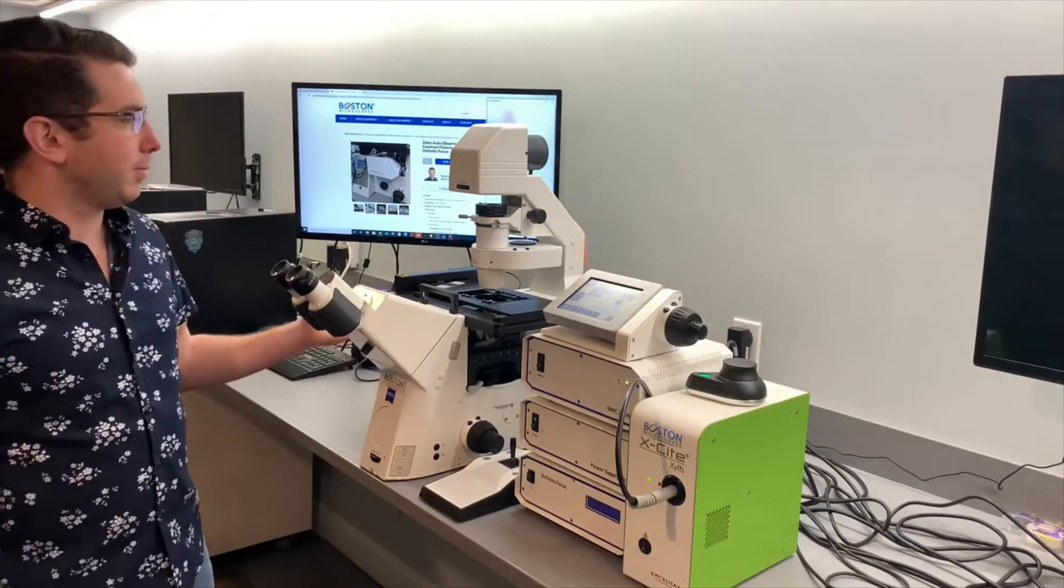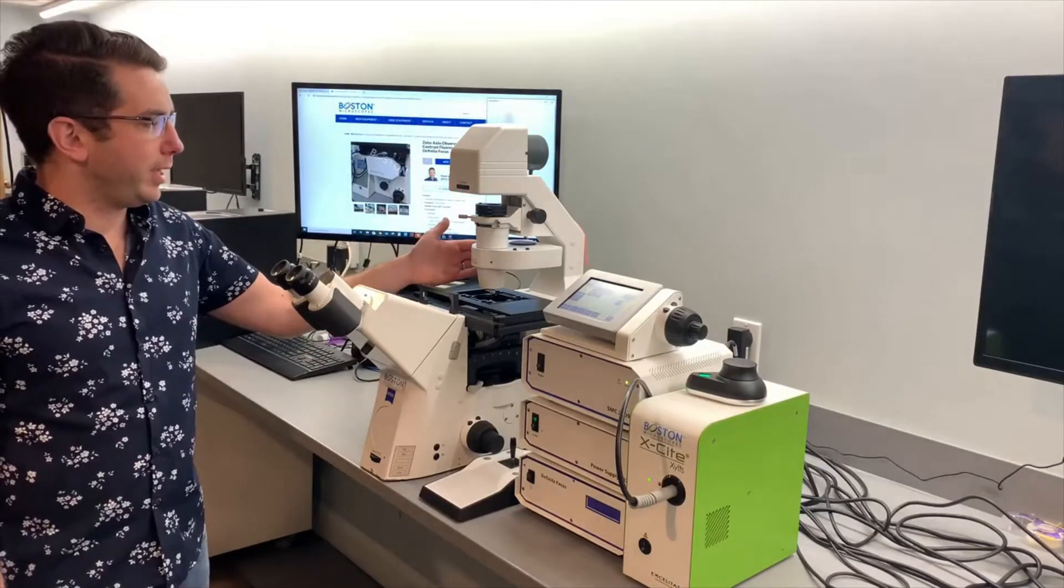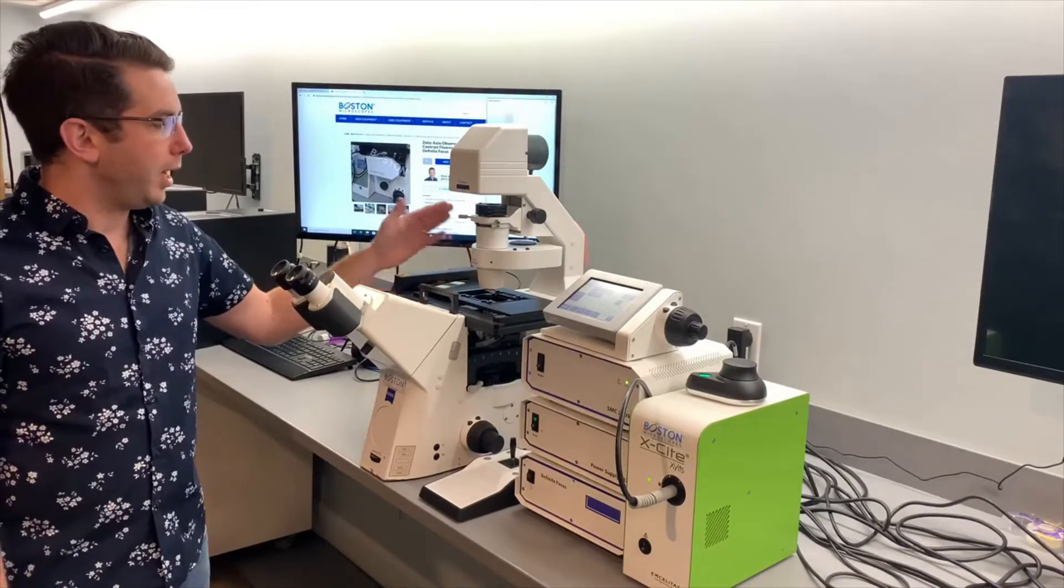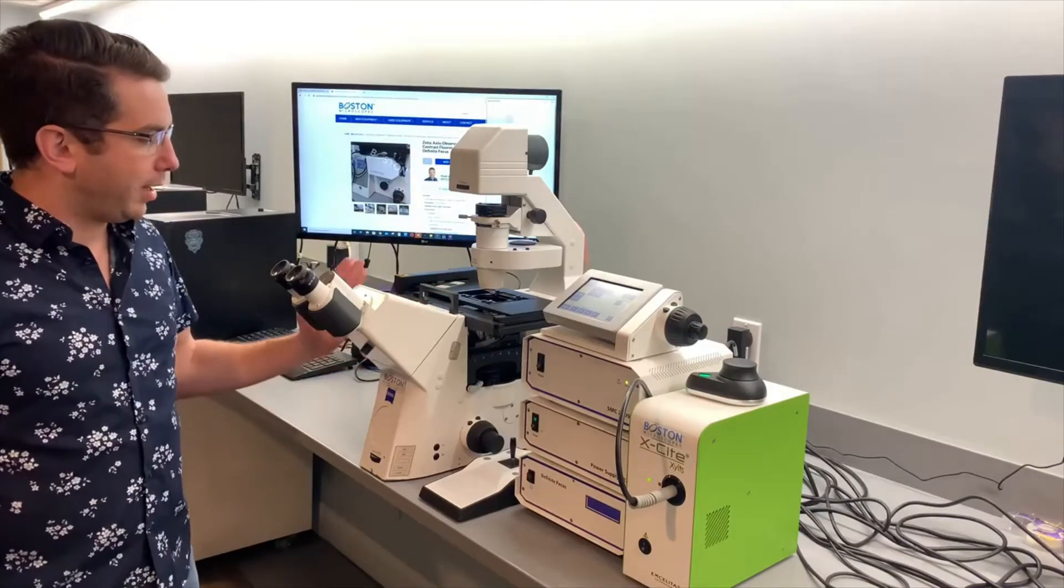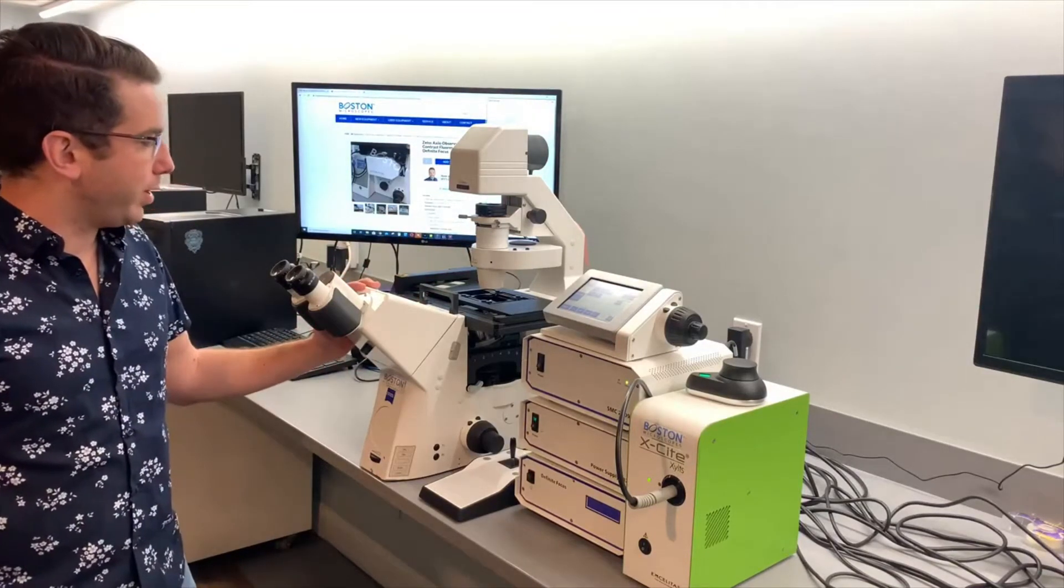On this particular model we have a motorized phase condenser, a motorized Mertzhauser stage, and on this microscope we actually have it set up with Definite Focus.